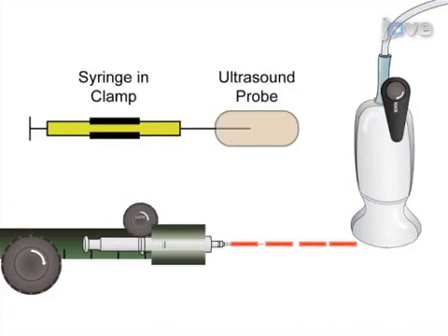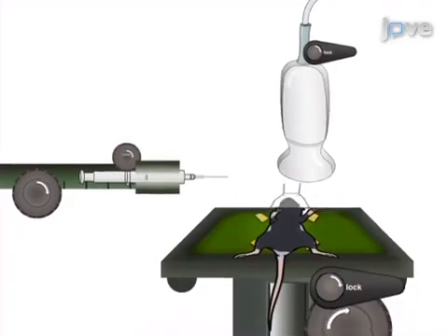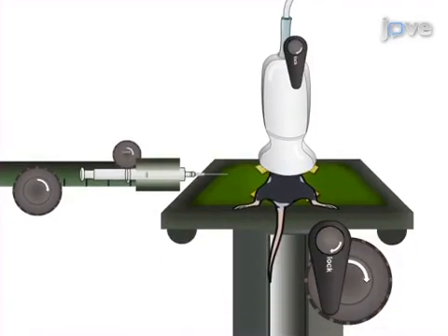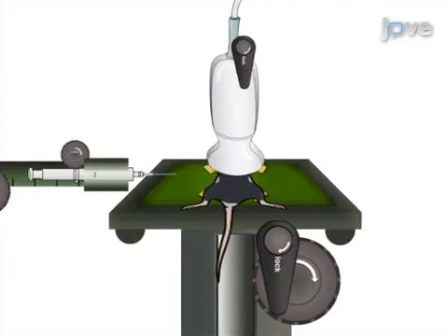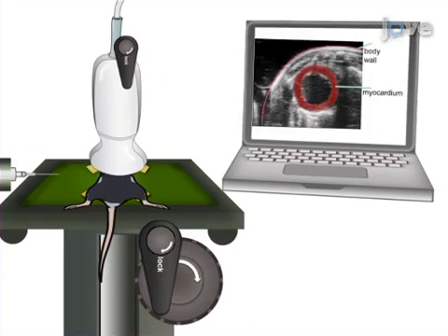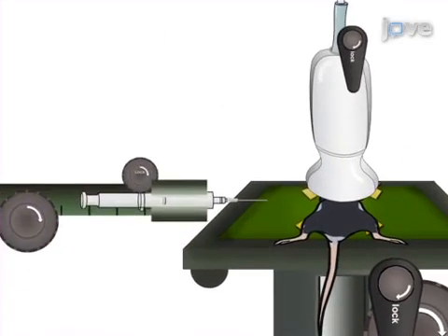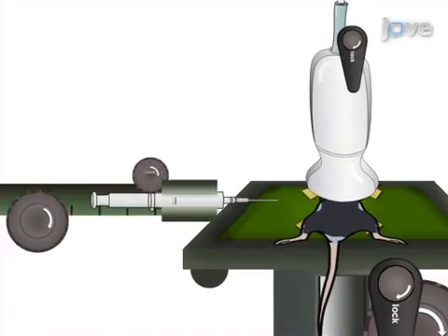This is accomplished by first manipulating the transducer orientation so that it is aligned parallel to the axis of the delivery needle. Next, the recumbent and anesthetized mouse is appropriately placed on the animal platform to facilitate targeted injection. Then the optimal acoustic window is defined for accurate delivery of injectate through minor adjustments to the animal platform, displaying a wide field of view.